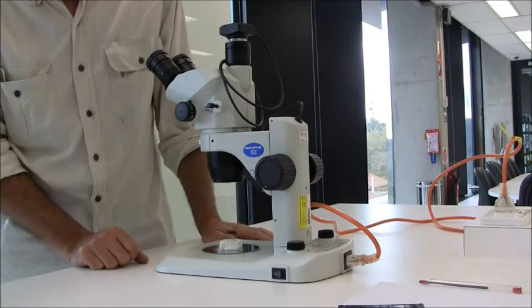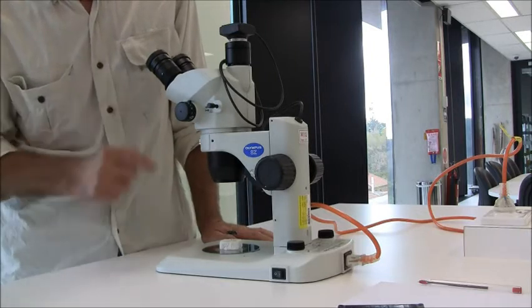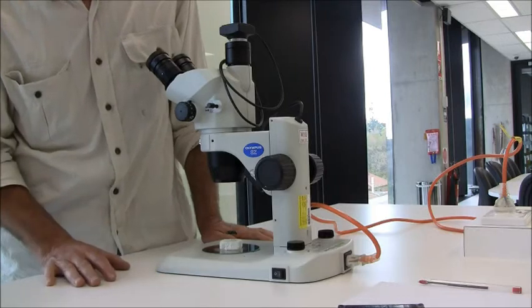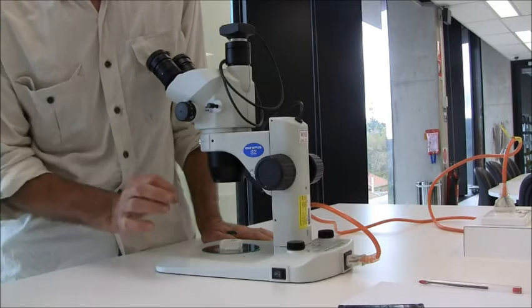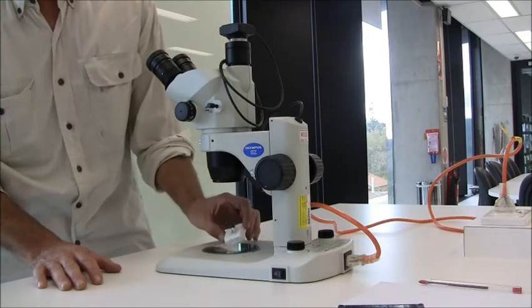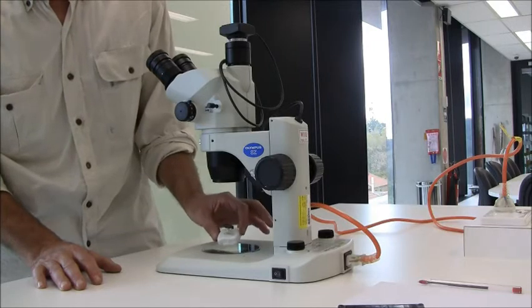And it fundamentally works by bouncing the light off the specimen through the series of lenses and into your eye, different to the compound microscope which passes the light through the specimen. So generally the specimens are solid, like this Coleoptera that I've got here for an example.